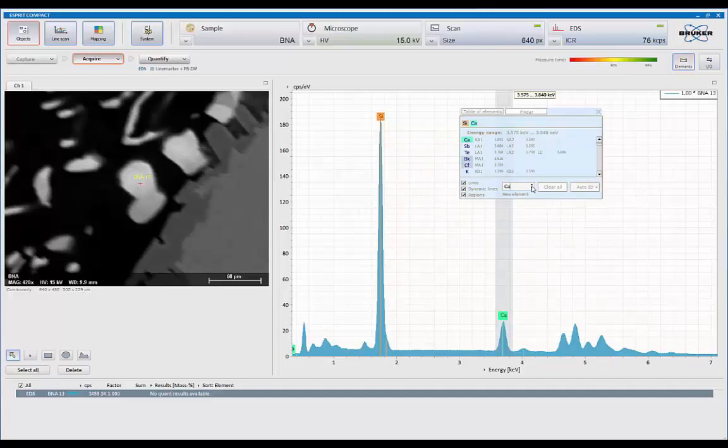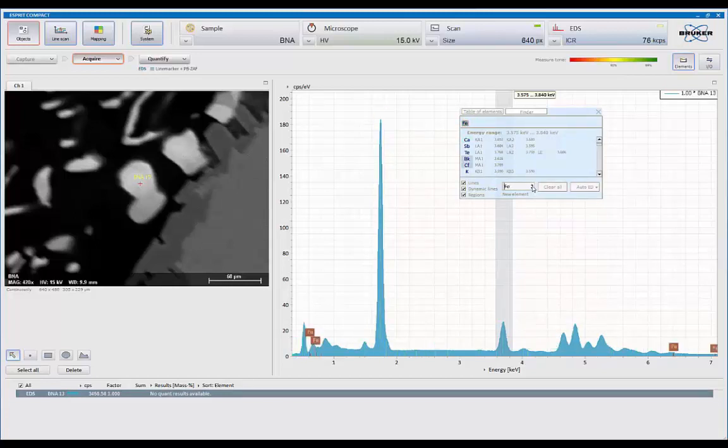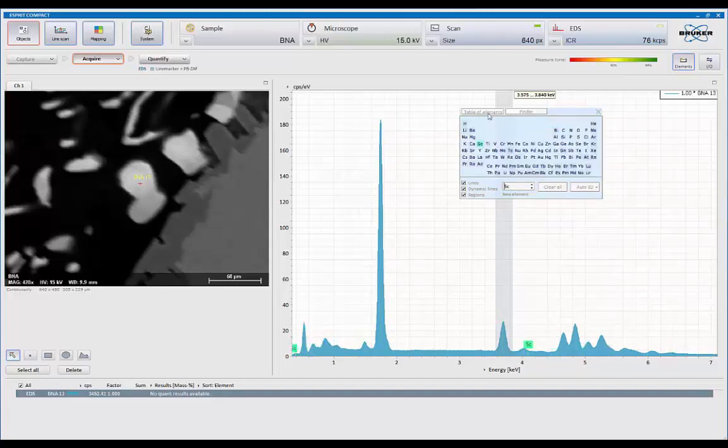You can also, at any point in time, pick up any marker and move it up and down an atomic number, basically following the rules of Mosley's Law. So as we go up and down in energy for a line series, you're going up and down an atomic number.